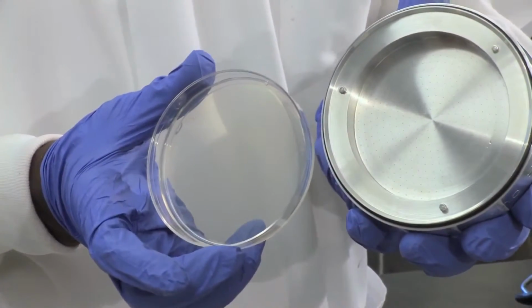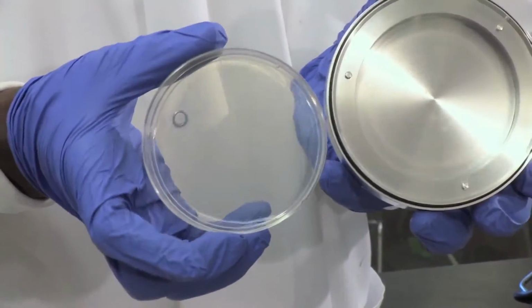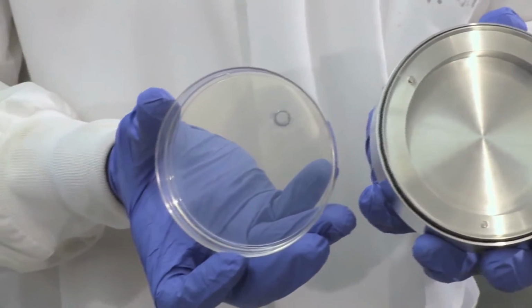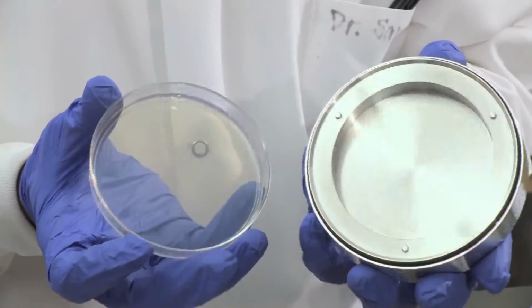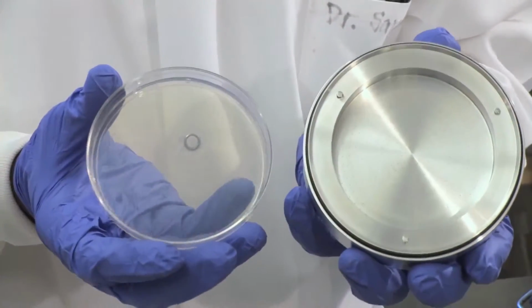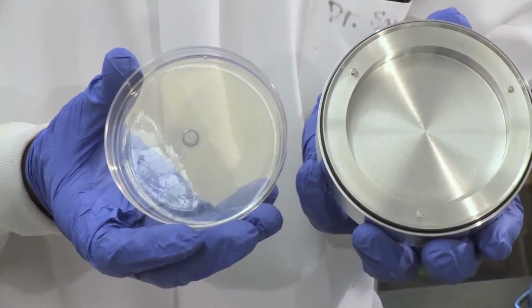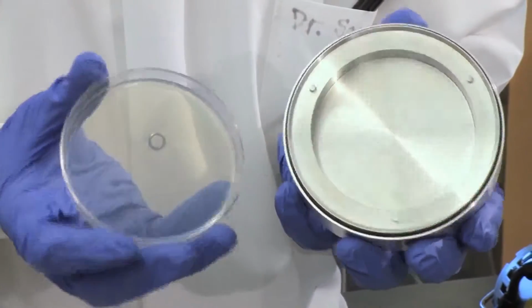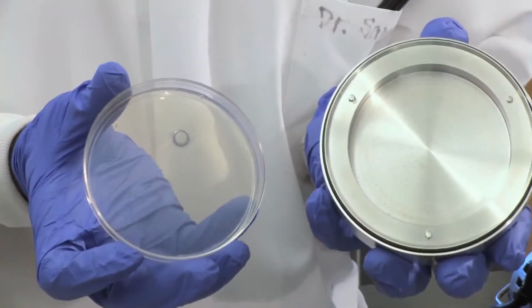So remember, these are letting through particulate that are half micron to about 1.1 micron. And it is in this range that there is most concern, as I mentioned earlier. 1 to 2 micron particulate getting into the lung tend to be retained in the lungs.